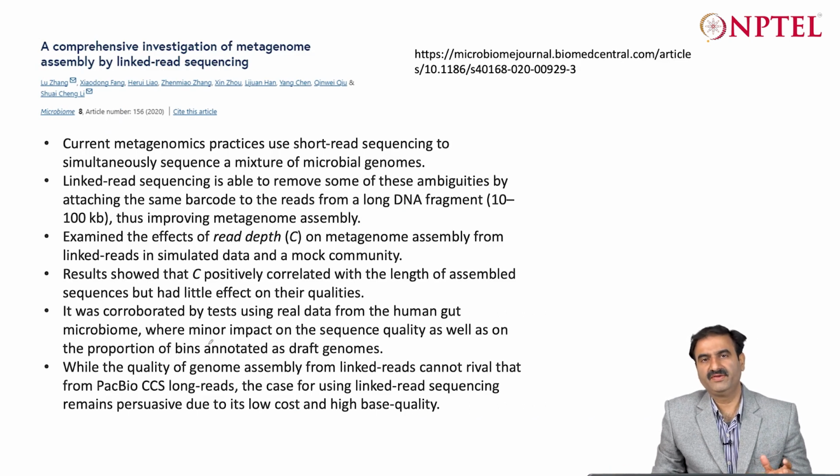Another paper showed the significance of linked read technology in metagenome assembly. Earlier, metagenomes suffered because short reads are generally used for assembly, which leads to smaller quantities or inappropriate assembly. Even the draft genomes produced only by short reads still have more than 100 pieces, which is not appropriate for such small genomes of only 5 million base pairs or so.